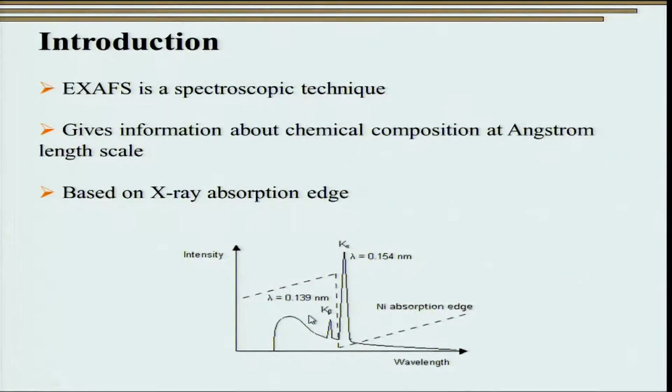So, just to recollect it again, here you can see a normal spectrum as a function of wavelength for say something like a copper target. Herein you see how we get the absorption for a nickel filter, and here you see that the absorption essentially increases with the increase in wavelength. However, at a particular wavelength there is a sudden drop in the intensity and this occurs because of absorption. So, our today's technique EXAFS essentially focuses on this kind of phenomenon, this absorption edge that we are seeing in the figure discussed over here.